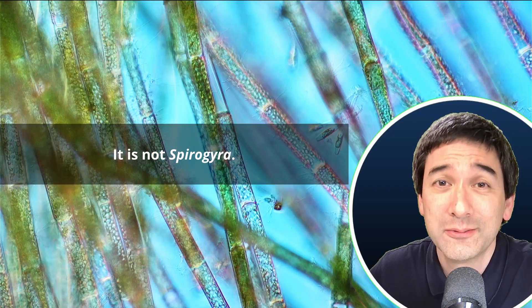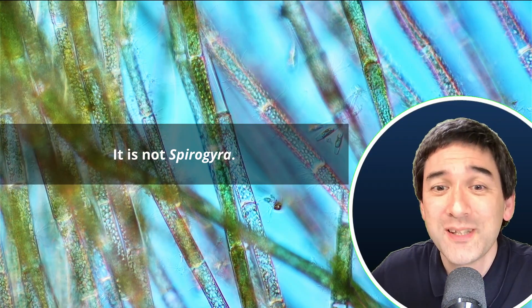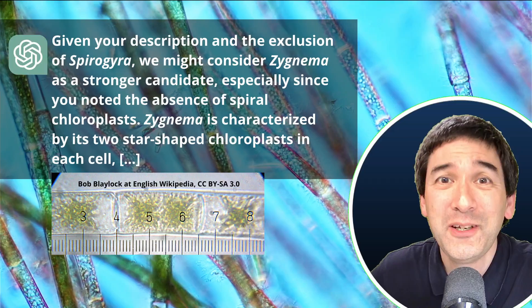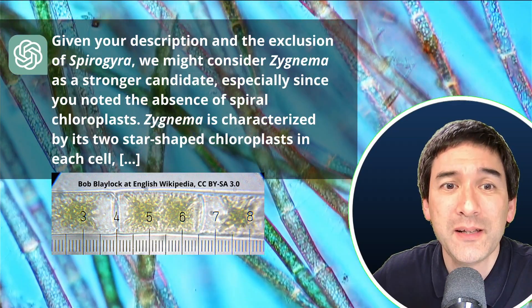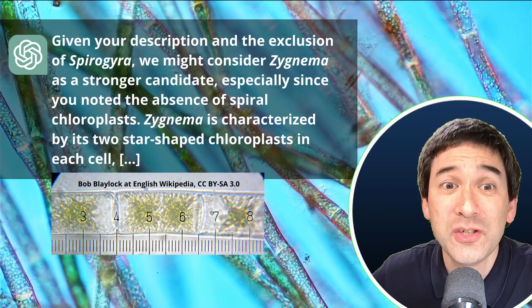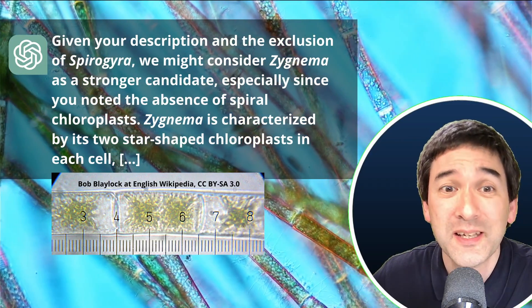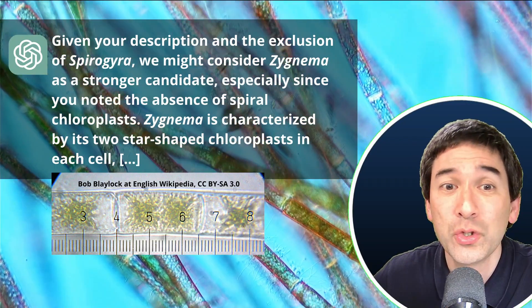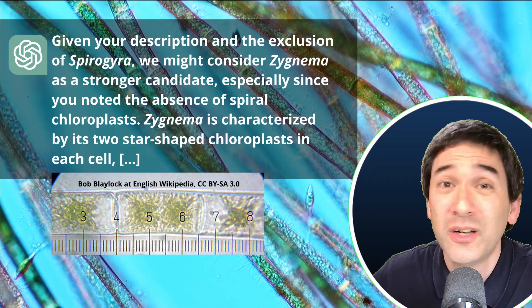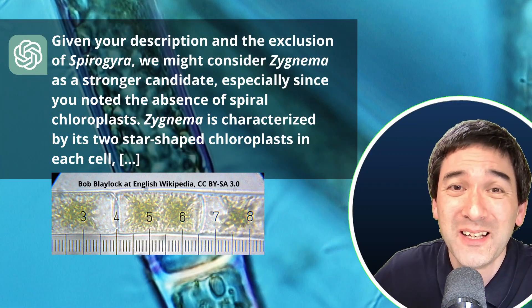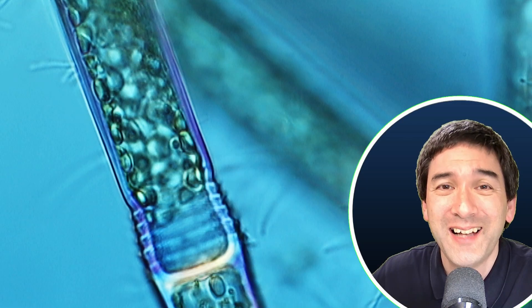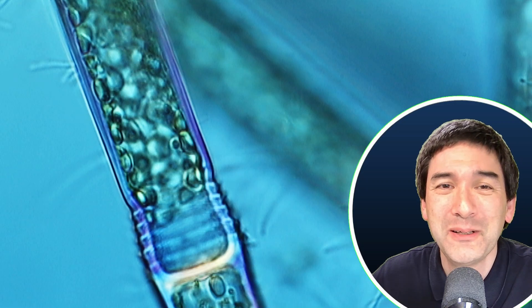So I said it's not spirogyra. And then it kept on suggesting other possibilities here. Given your description and the exclusion of spirogyra, we might consider Zygnema as a stronger candidate, especially since you noted the absence of spiral chloroplasts. Zygnema is characterized by its two star-shaped chloroplasts in each cell. No, that's also not the case. And again, it's completely ignoring those ring-shaped structures. And it suggests another possibility as well.